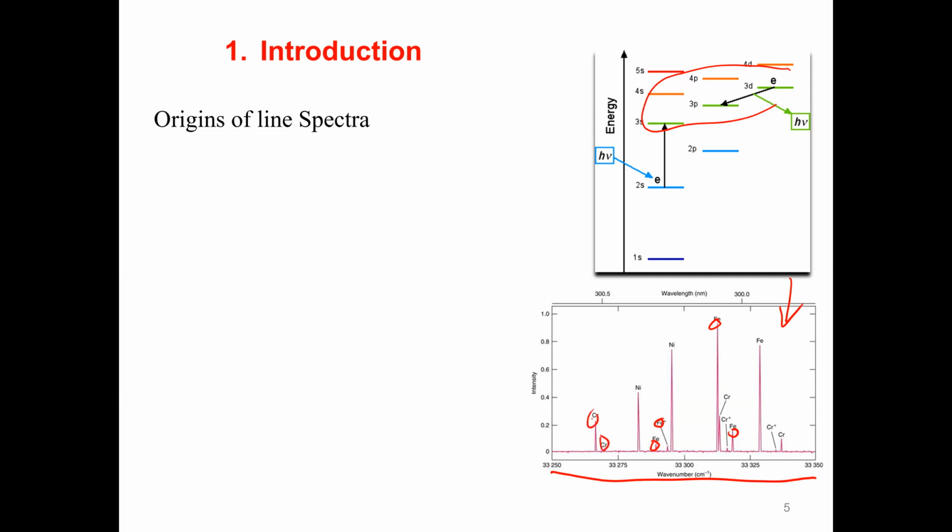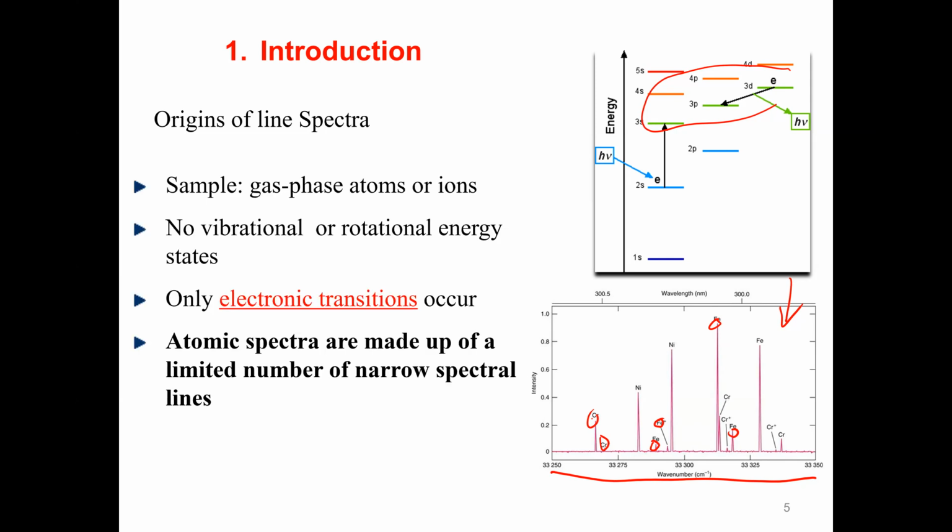And because, as we can see from the electron transitions, they have a different stage. Electrons transfer to different levels. That's why you got different lines. Again, here's the feature I want to repeat.